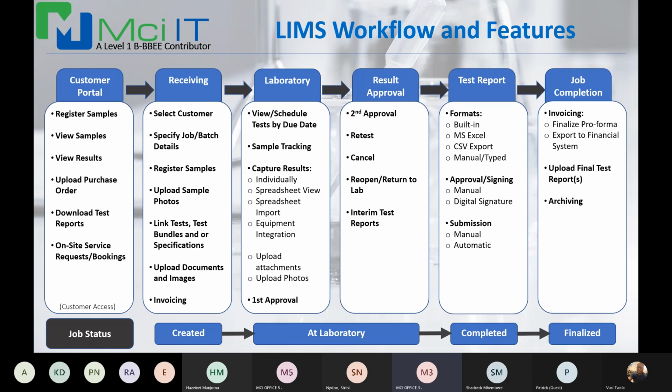It's extremely difficult to do a full-blown implementation all at once, because most laboratory customers are moving from manual systems to electronic systems, and so have little insight or understanding of the value add of an electronic system as is. So it's just better to take a staggered approach like that, unless the customer insists that he wants to do everything in one go. But we prefer to advise against that.